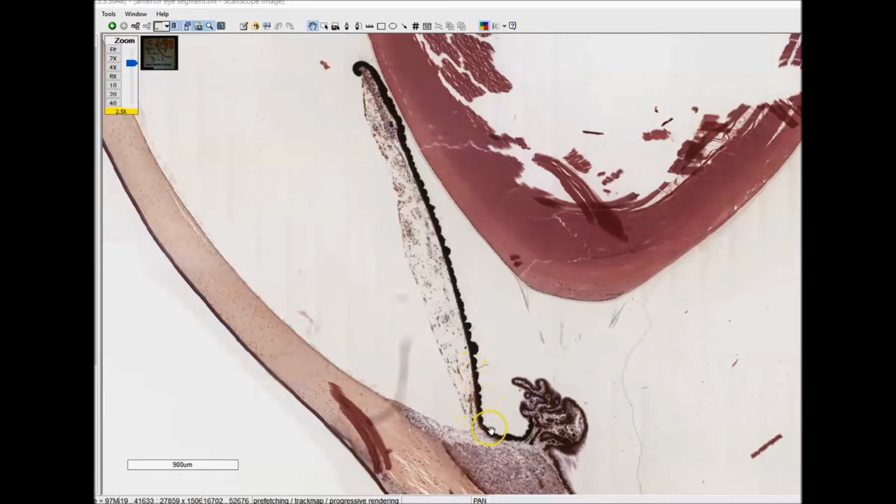So looking at this, you can see that it has this very thick epithelial layer that is highly pigmented in the back, but that's not what controls the eye color. It's the amount of pigment in the actual stroma here. So if you have a lot of pigment in the stroma portion of the iris here, your eye is darker. If you have less, it's lighter.